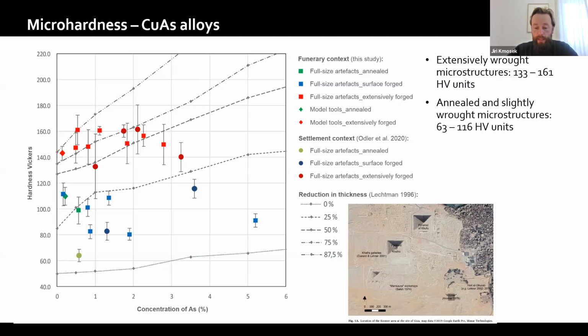This is the theory. We can simply say that if we make some pyramid hole inside the flat sample surface, we will measure the size of this hole. We can see some correlation between the plasticity of the material and the hardness. And if we have simply a big hole inside of the material, it means that the hardness of the alloy is very low. The Vickers hardness measurements were performed by the microhardness tester on mounted and polished metallic cross sections of archaeological samples with a load of 100 grams and a dwell time of 10 seconds.